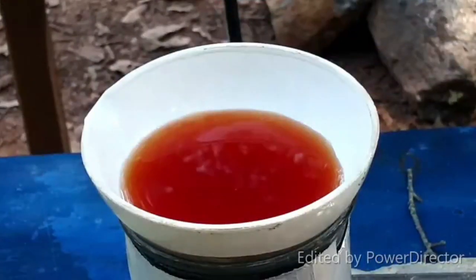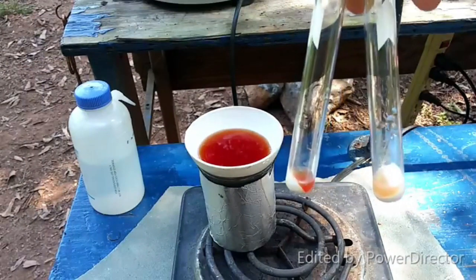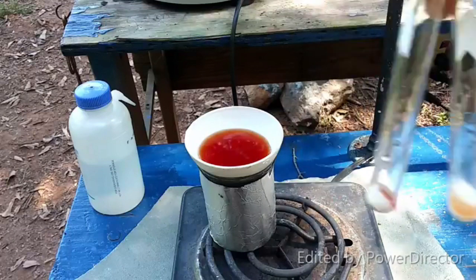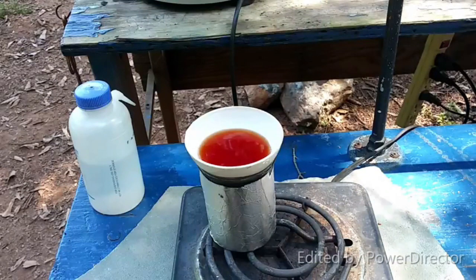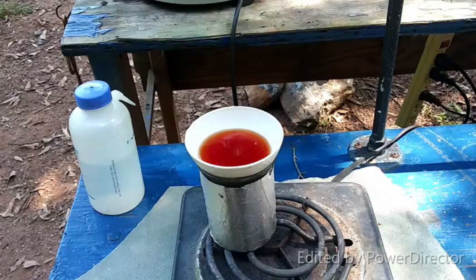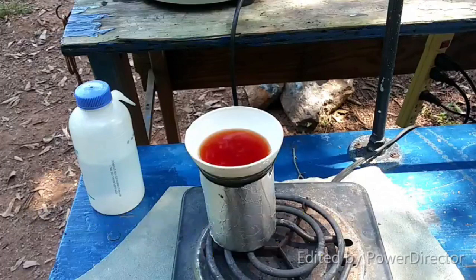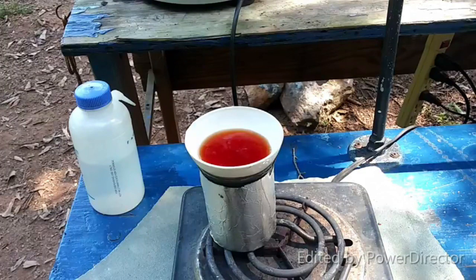Okay, everybody, so here is the first half of the solution. This was from the portion that was more heavily laden with barium sulfate. As you can see, I was able to centrifuge it off pretty efficiently. I have two other tubes that don't have anything close to that amount of barium sulfate in them centrifuging right now. I may go ahead and let this evaporate down as is for now, just to make sure that my assertion about heat not being detrimental is in fact true. Always helpful to check if your guesses are true before you use up your expensive stuff. So anyway, I will come back when I have something to report.